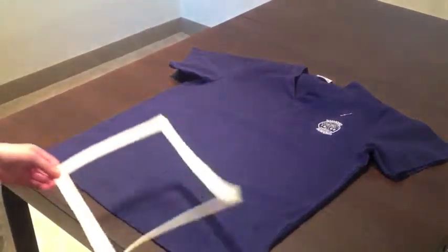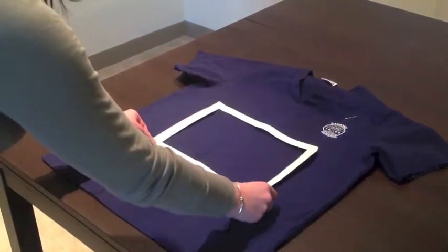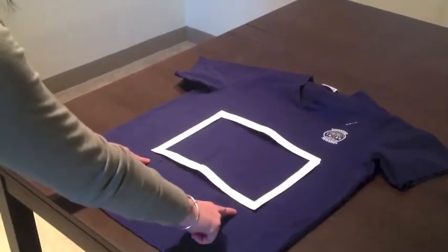Remove your template from the supply bag and place it onto your scrub top so that the bottom edge rests just above the pocket lines.